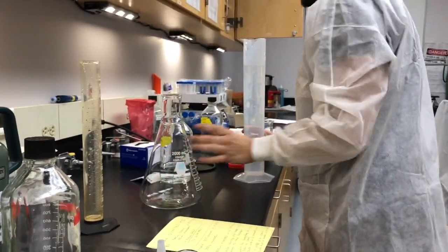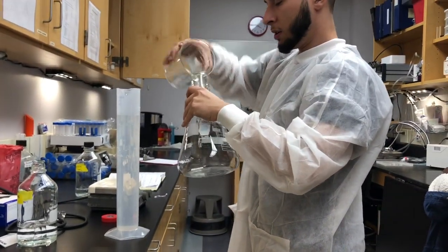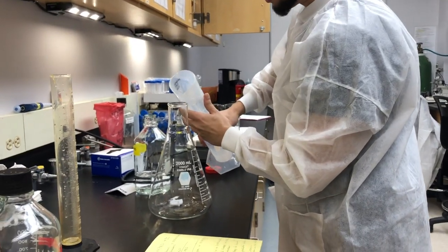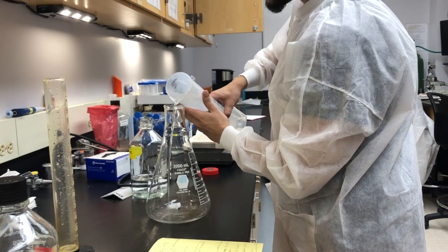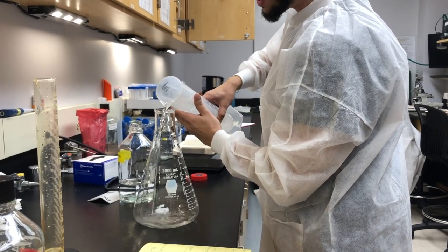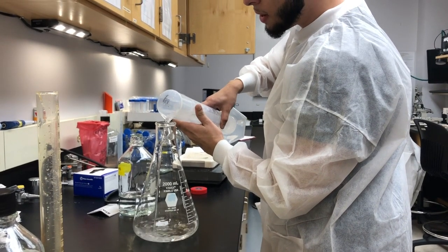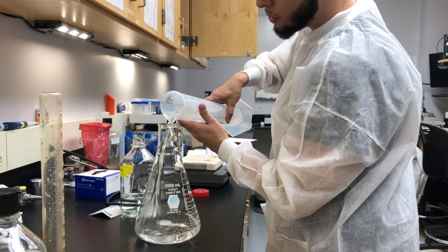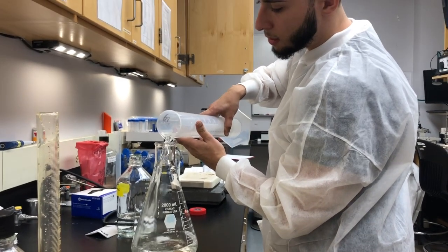So we're going to put it into our flask and put our stir bar in here, then put our mixed solution in. We're going to stir it so we allow it to properly mix. You don't have to stir it too much — give it about a minute. And once it's completely stirred, you can put it in your beaker.